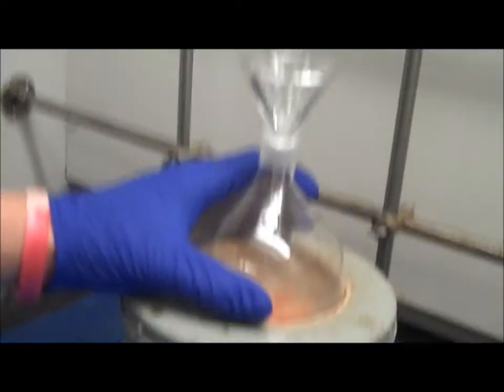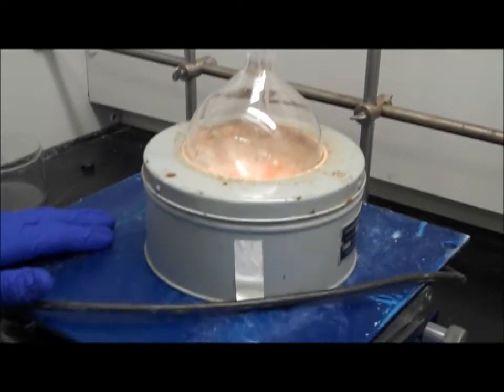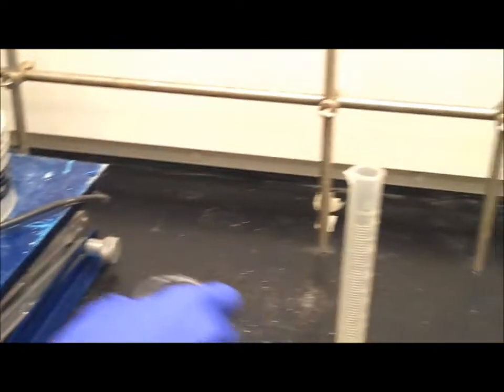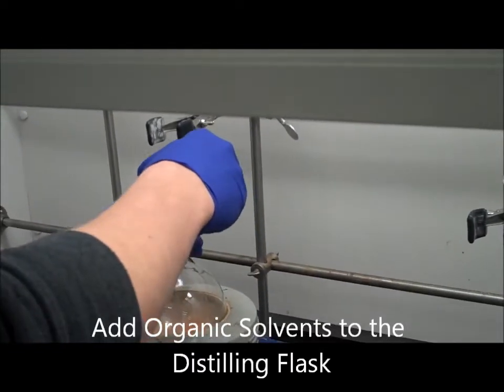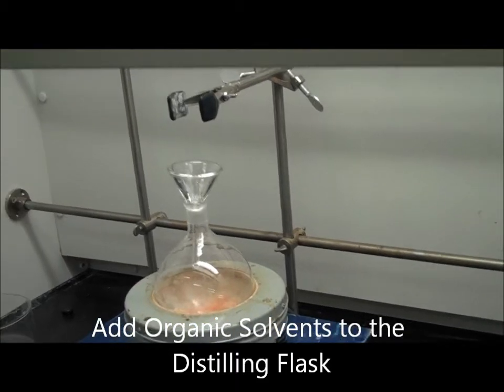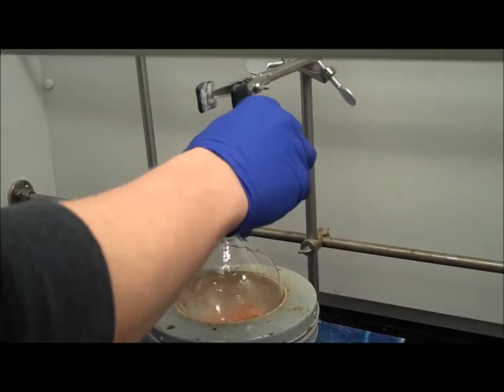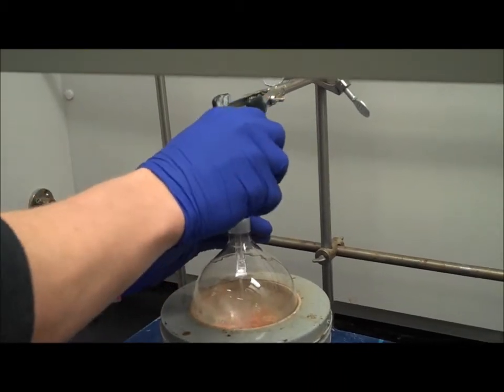The first step to setting up your distillation: you have your distilling flask inside the mantle, which is on the jack. To add your chemicals, we have 25 milliliters of acetone into the distilling flask. You can use a funnel to ensure that you don't spill any chemicals.